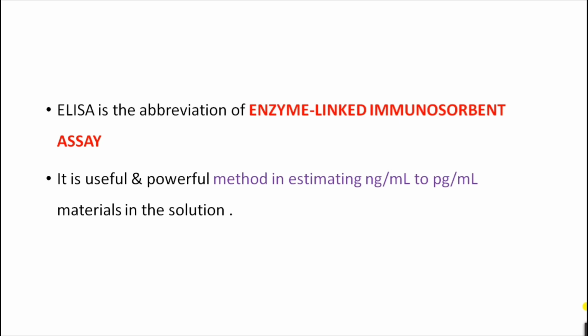ELISA is the abbreviation of Enzyme Linked Immunosorbent Assay. It is a useful and powerful method in estimating nanograms per ml to picograms per ml of materials in the solution. So we can say it is a highly sensitive and specific test.